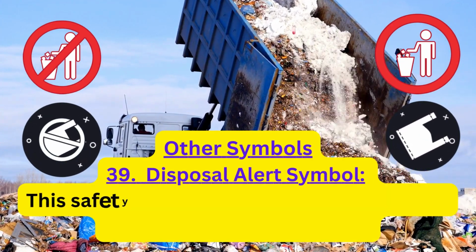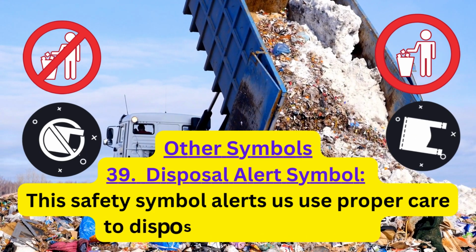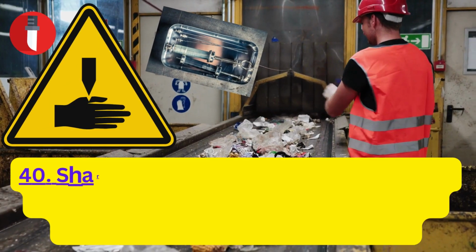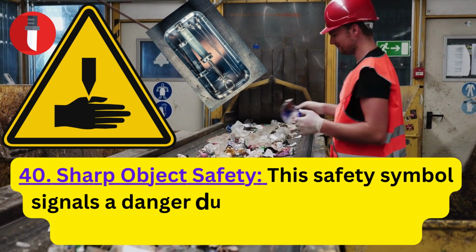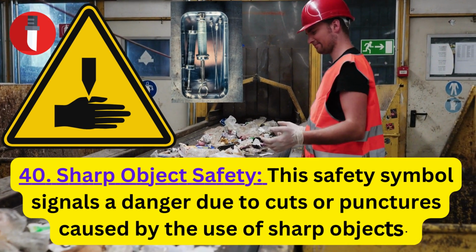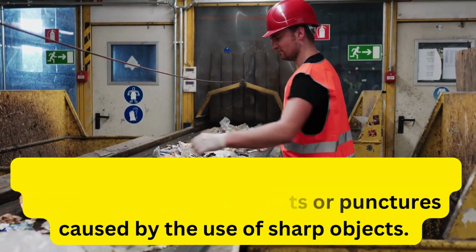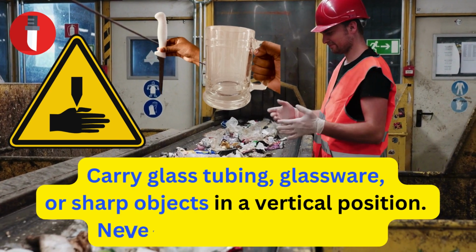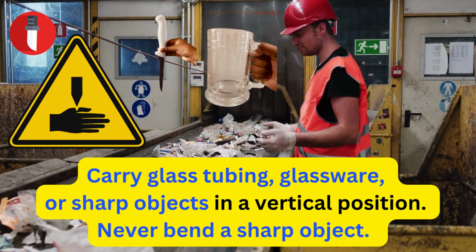39. Disposal alert symbol. This safety symbol alerts us to use proper care to dispose of materials safely. 40. Sharp object safety. This safety symbol signals a danger due to cuts or punctures caused by the use of sharp objects. Carry glass tubing, glassware, or sharp objects in a vertical position. Never bend a sharp object.